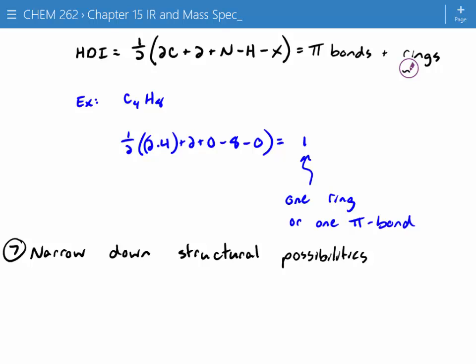If you watch CSI, they make it sound like it's this savior of chemistry that will tell you any molecule very conclusively. The reality is it tells us a lot of information, but it doesn't tell us the complete story. If we're looking at diastereomers, it won't tell us which diastereomer we have. If we're looking at enantiomers, it'll tell you the molecular weight, but you won't know whether it's R or S. So mass spec is somewhat limited in its usefulness. It tells you a lot of information, but it's just one tool that chemists have at their disposal.